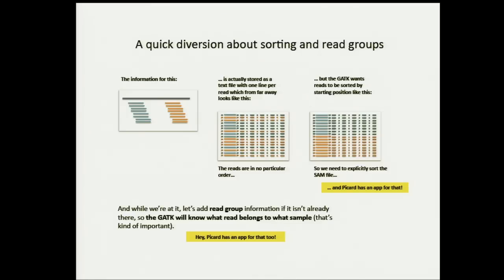It's really dependent on your organism, on the machine, your experimental conditions and your sample preparation. There's a lot of parameters that go with what is a reasonable duplication rate. For SNP calling, for most analysis that depend on the statistical significance of the observed bases in the pileup, you really don't want any duplicates at all. You want to have one true observation from each molecule. So you achieve that by marking duplicates. You don't worry so much about the duplication rate coming from the sequencing platform because you will mark them all down. The only problem here is that you're wasting sequencing when you have a lot of duplicates.